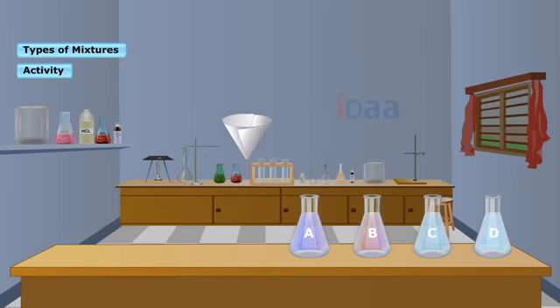In the mixture D, you will notice that there is nothing in the filter paper. This is a colloidal solution and we will study the properties in the subsequent sections.